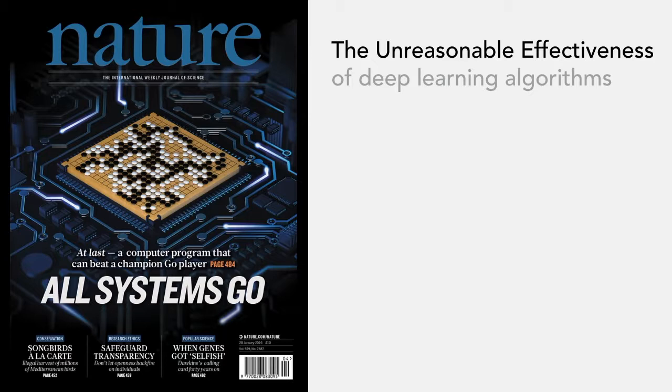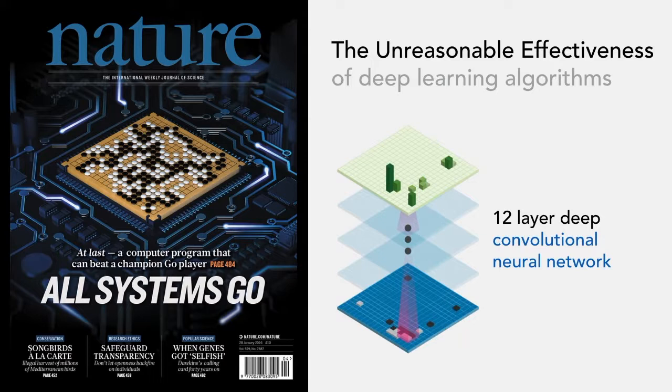So we used something that has been used by many already, as mentioned in a previous talk: deep convolutional networks. One interesting thing is that this is a new principle of machine learning that's been spreading throughout the whole scientific realm. One fabulous example was how this was used by DeepMind to beat the best human players in the world at Go. And one key thing of these deep convolutional neural networks is that they can do processing that is very akin to what the retina or the brain does.